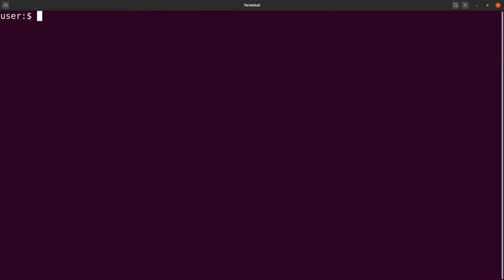Now we will just test the tools. We just want to make sure everything is okay. To test the tools, we need to first activate the environment. With conda, if you want to run the tools, you first have to activate the environment which has the tools, and then you can just run them. So I'll say conda activate, and then I'll indicate the environment name, which is variants. After a successful activation, you have the name appearing on the terminal. So that is what we have here.